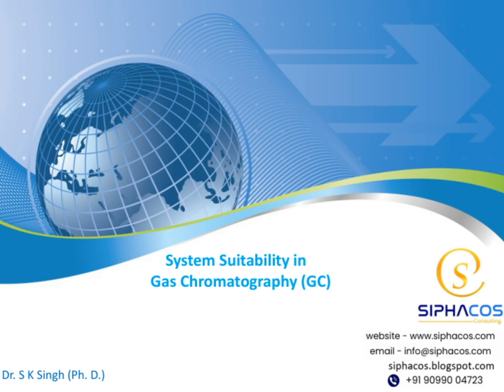Today's presentation is titled System Suitability in Gas Chromatography, and it's an important topic for anyone working with GC techniques. We will explore what system suitability means, why it's crucial, and how to ensure your GC system is performing optimally. So let's get started and dive into the fascinating world of gas chromatography.